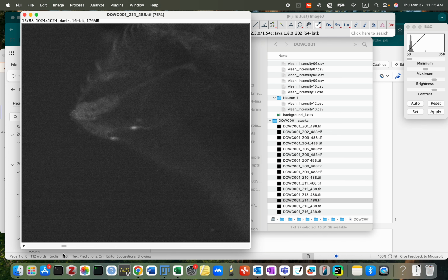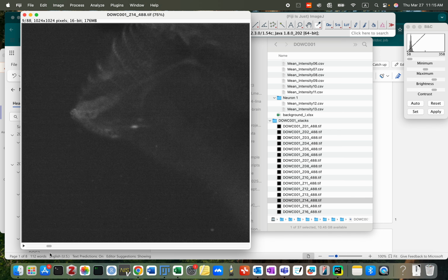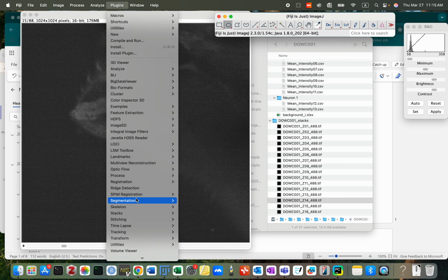It's getting weaker. I see a brighter time point, so therefore I will analyze these stacks. Okay. Even though most of the time points I see they are weaker than the previous stack. Yeah. Be safe. Let's still analyze this stack.